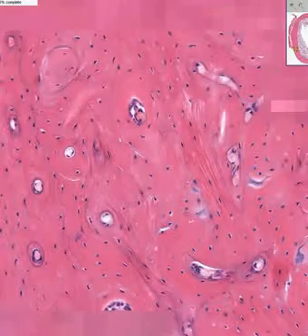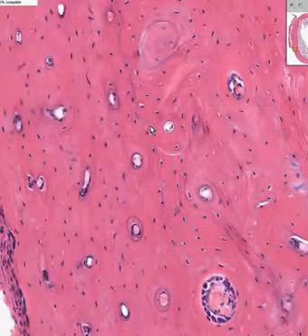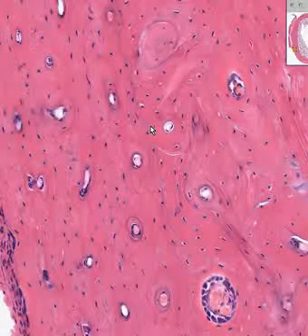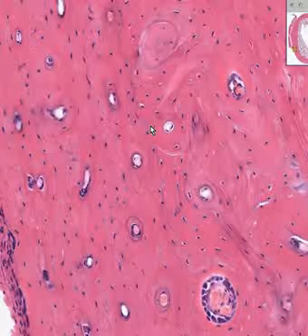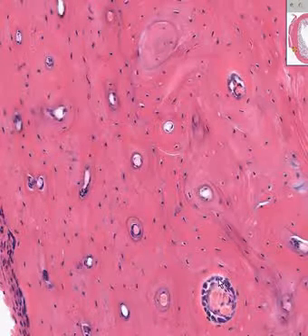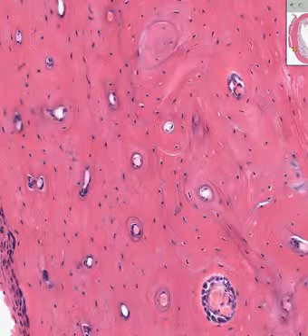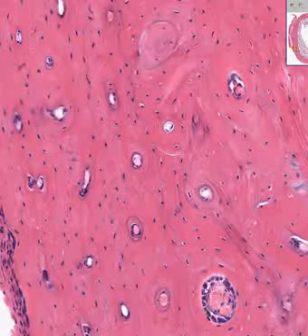So once again, I will ask you, like I have asked you in all of these exercises, what is there in this field or any field that you could not possibly identify? I think we have properly shotgunned this slide. Perhaps one more thing I would like to mention is that when you see cells like this, which eventually get trapped up as a concentric ring within the Haversian unit, these are actual osteoblasts.